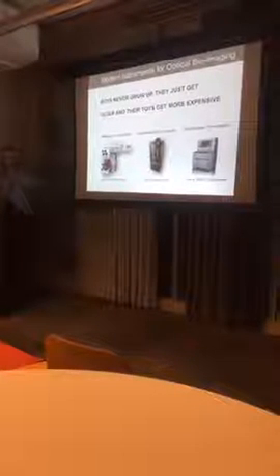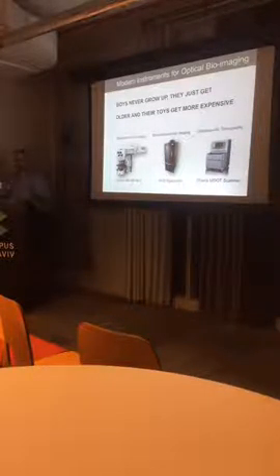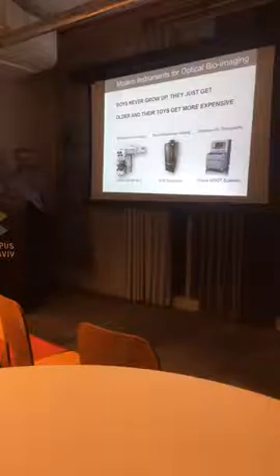What is good with bioluminescent imaging is that, of course, the resolution is lower, but we can use the whole animal. We can see, for example, where the metastasis is. The signal-to-noise ratio is much, much better, a few orders of magnitude better than fluorescence. And this is optoacoustic imaging, where we use light to produce sound, combining light and ultrasound together. It could be another lecture, what types of advanced imaging are available and what we can do. But my idea today was to speak about a simple system.